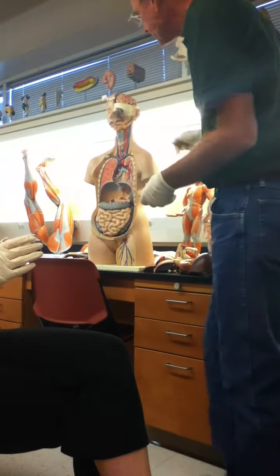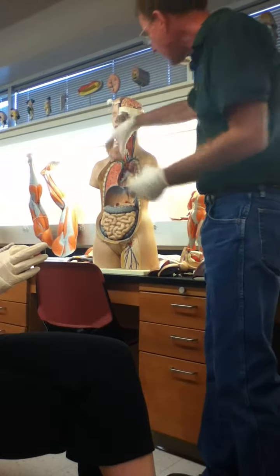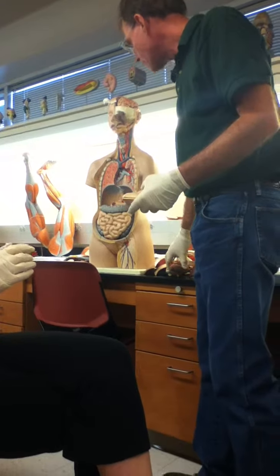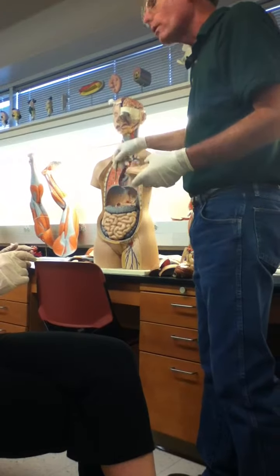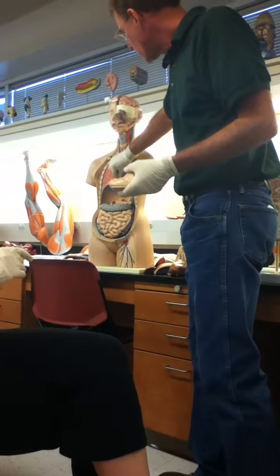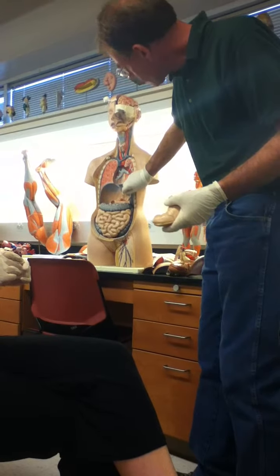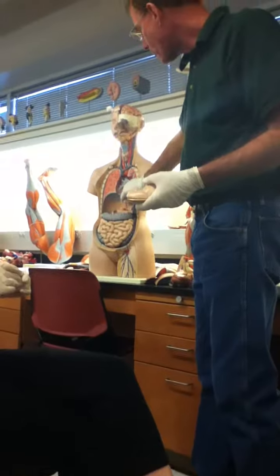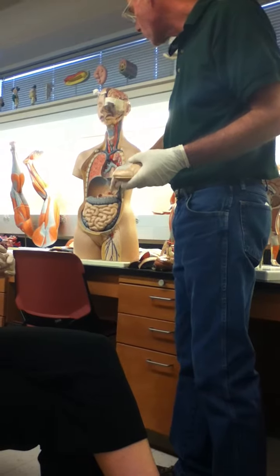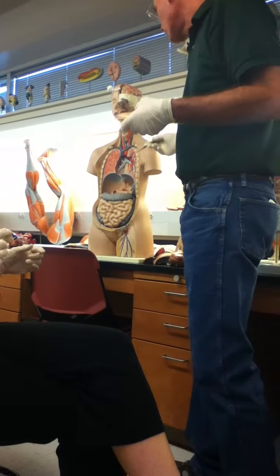But before I do the stomach, I want to show you these passage points. Here's your diaphragm, and this is the vena cava. So where the vena cava goes through the diaphragm, that's your vena cava hiatus. And you can find that on the cat. It's not a hole, it's not a notch or anything like that. It's a passage point where the vena cava goes through the diaphragm. Your esophagus goes through the diaphragm at the esophageal hiatus, which is right there. Your thoracic aorta goes through the diaphragm at the aortic hiatus, which is right here. And that's an important landmark when you guys learn your blood vessels later. So that's one of the reasons I'm telling you this stuff.